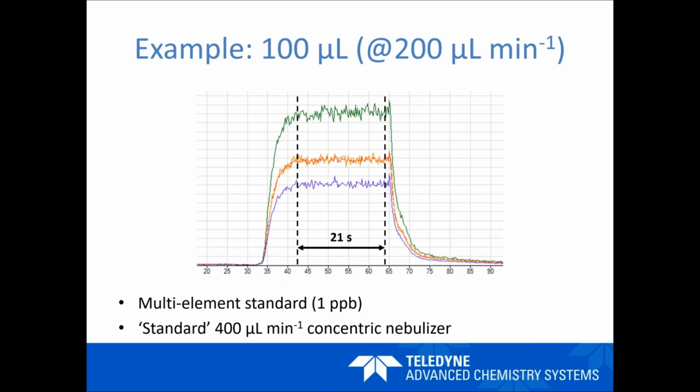Nothing particularly special about it, a standard industry nebulizer. Now, I've taken 100 microliters of this solution. 100 microliters, some people, is a lot of solution to work with.